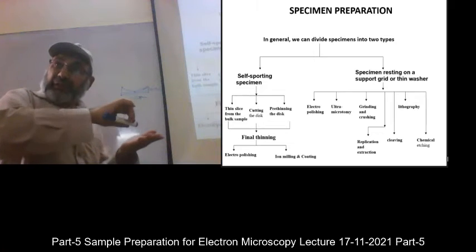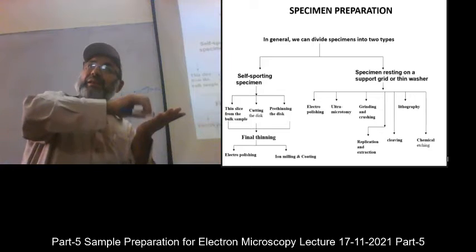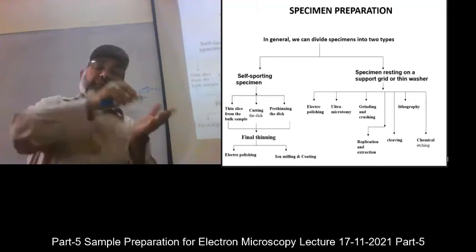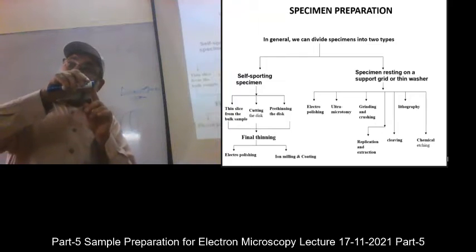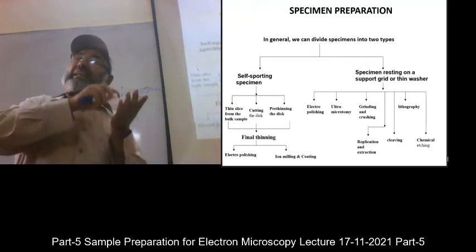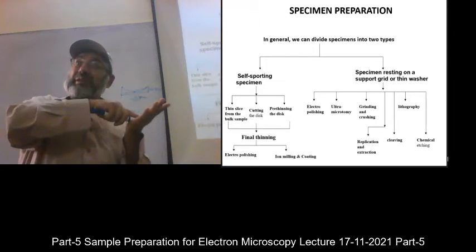The sample is rotating, the wheel is moving like this, but the sample is horizontally in rotation. So when it is in rotation like this, in the middle they create a dip. But that is cloth, and it is not because of the mechanical strength of the cloth, but because of the diamond.